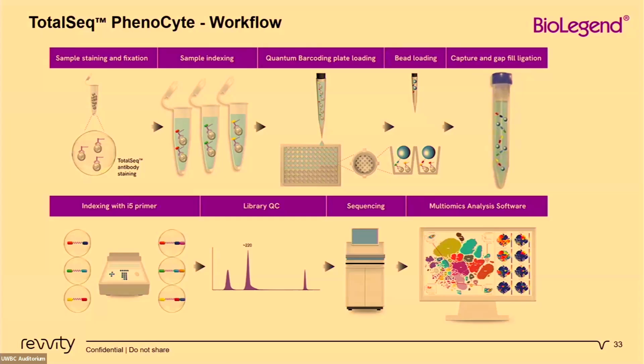Even if there's more than one cell in a well, you're going to have hopefully unique combinations of, let's say, the I7 that was red plus the bead barcode, and then the I7 that was yellow plus the bead barcode, and then you have 2 different cells. Once labeled, all this gets dumped out of the plate using a fancy little funnel and put into a reaction to fill the gaps between the different pieces of the barcode. The samples are then indexed with an I5 primer, and then you construct libraries, QC them, sequence them, and then go to our multi-omics analysis software to do your data analysis.